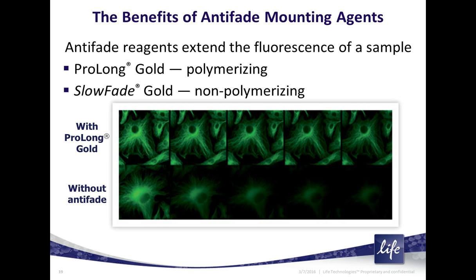Shield is another common one that's used, although it has a blue autofluorescence, which can be a problem for blue dyes, and it doesn't protect quite as well dyes in the red or far red as ours. So that's most of the protocol basic information that I had to share.